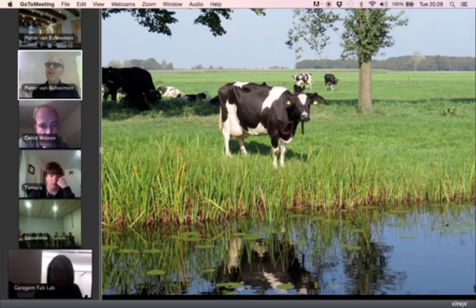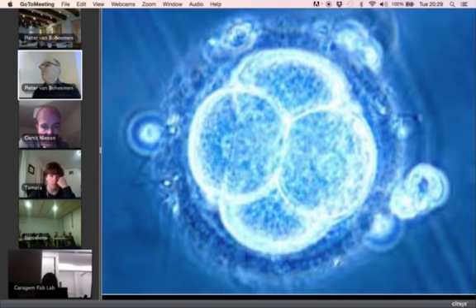So it's not a sterile hood, but similar to a sterile hood, it's not letting certain other living organisms in nor out. This is also a kind of sterile environment, although it can be permeated by other organisms, and then you have an infection, or it can infect other organisms. I don't have any images from that.